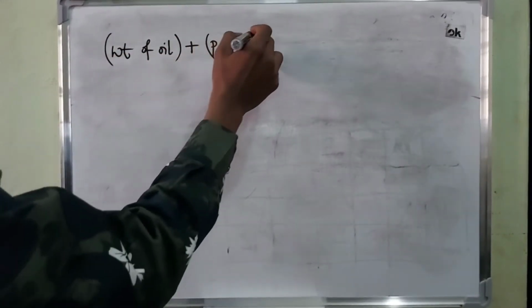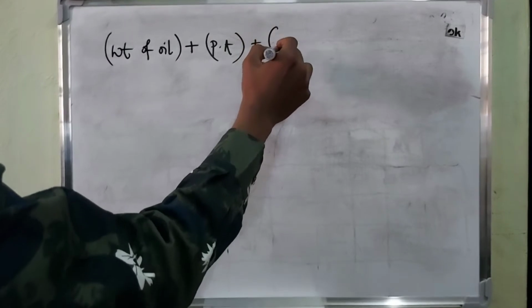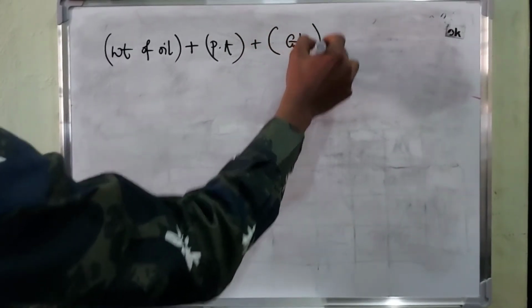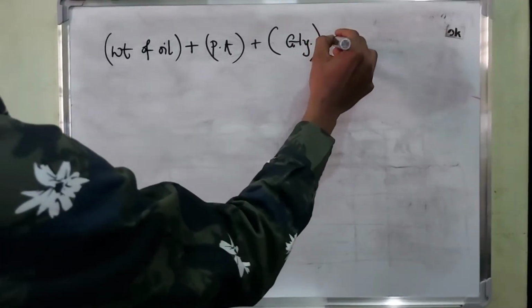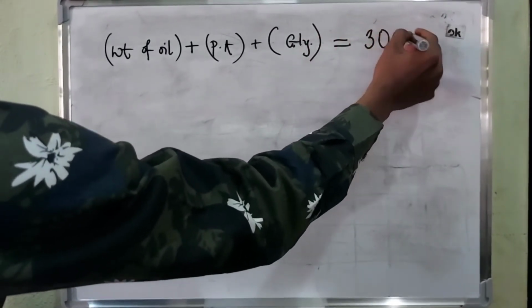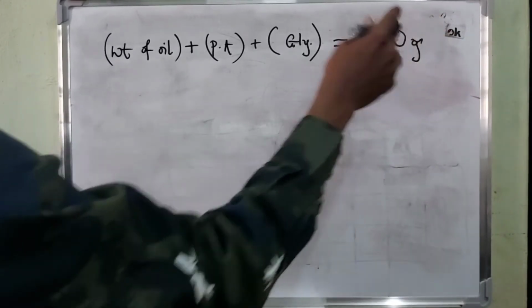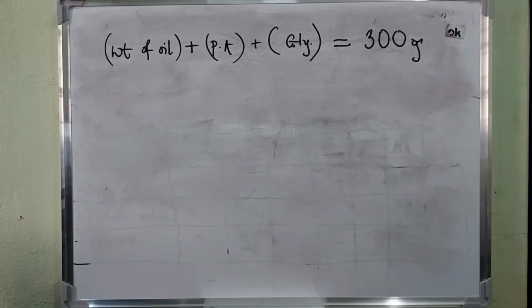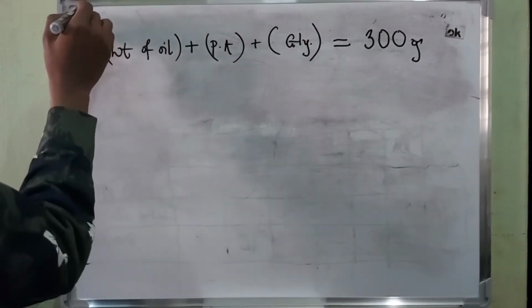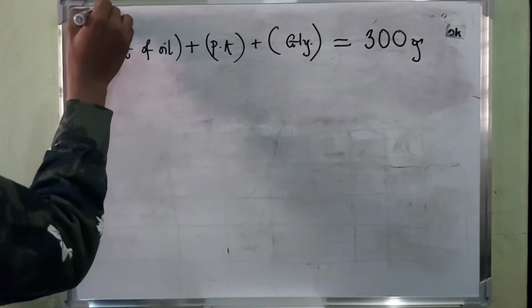That's the weight of the phthalic anhydride, and that of the glycerol, let's call that GL1, for a 300 gram resin formulation. So I'm equating it to that so that we get to find out what weight of the anhydride and glycerol we would be employing for a 40% alkyd resin length.